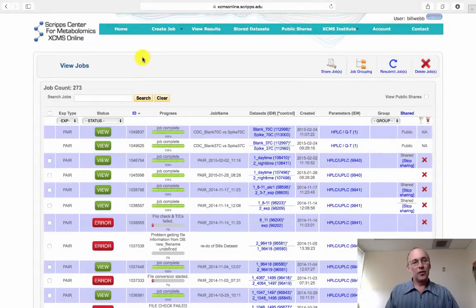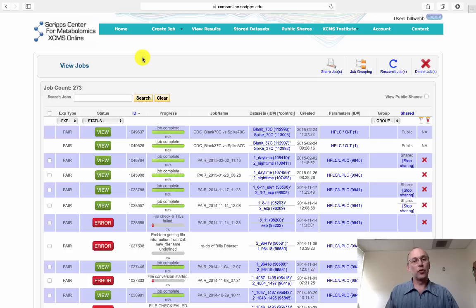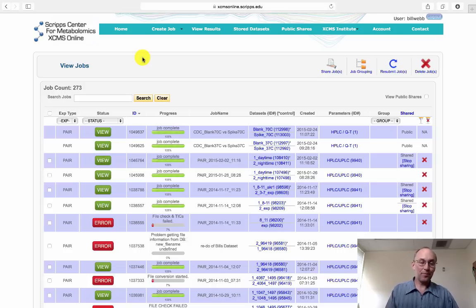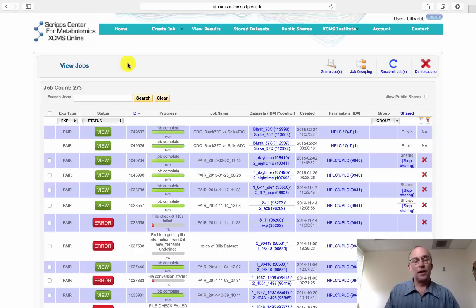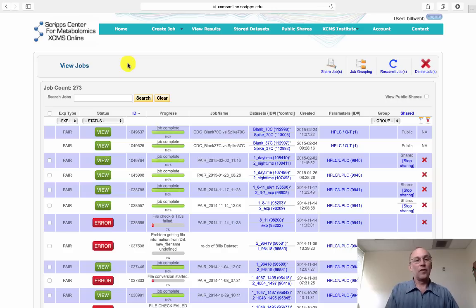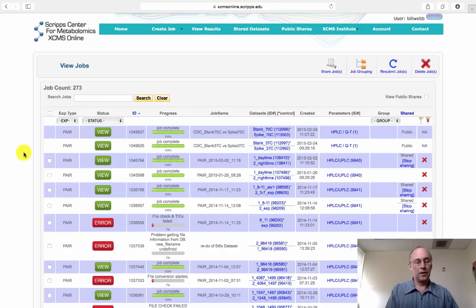Hello. In this video, we're going to discuss how we go about filtering results we get from an XCMS job. After you've run all of your samples, uploaded the files to XCMS online, process them through XCMS, we often get a web page that looks like this that allows us to view the results.